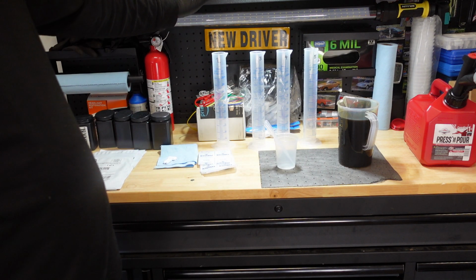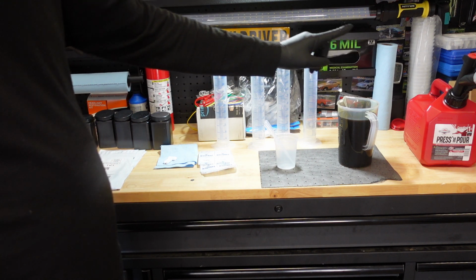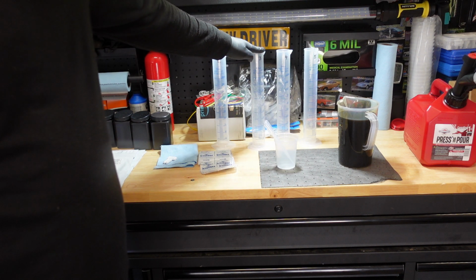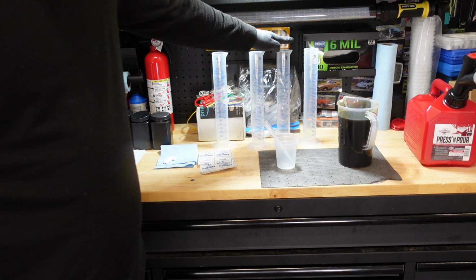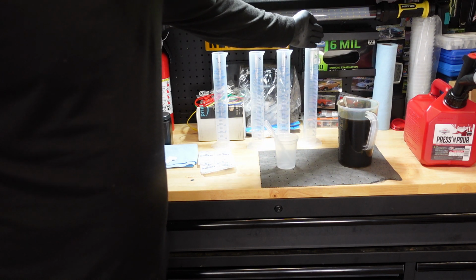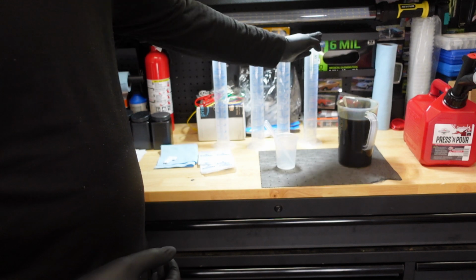Basically, we're going to add enough oil in here and then add a known amount of gasoline, beginning with 12% in this first one. Then I'm going to cut it in half and go to the next one. That's going to make 6%. For this one here, I'm going to cut it in half again. This is what you call a 2x dilution, and that's going to be 3% in this one. Then I'm going to do the same 2x dilution to this one, and in this graduated cylinder here, we will end up with 1.5%.